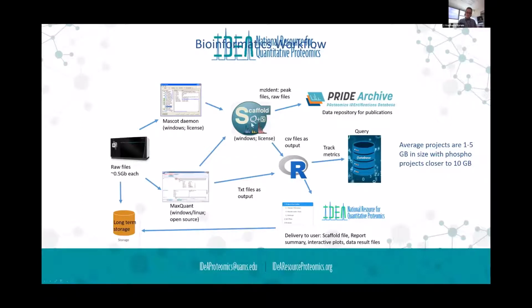And then for DIA experiments, we're actually using the exclusive intensities from Scaffold to import into R to do the downstream analyses. Most of the statistical analysis is actually done in an R platform. And then we're trying to build out reports and summaries of what the data looks like to help end users understand their data.